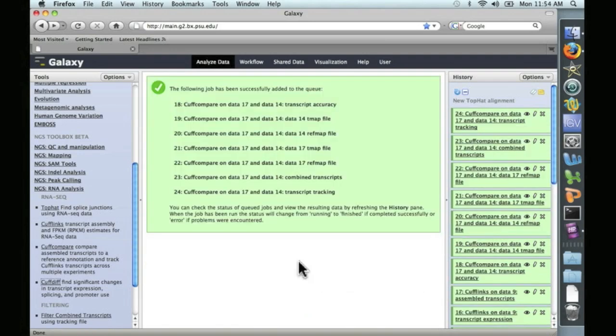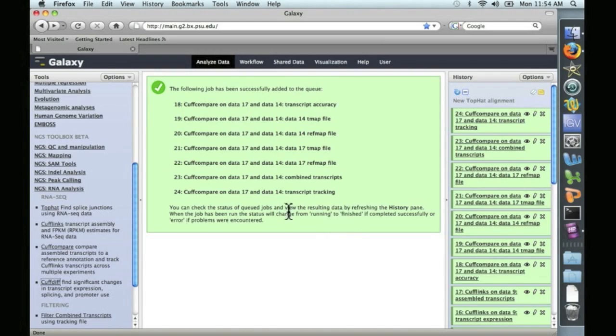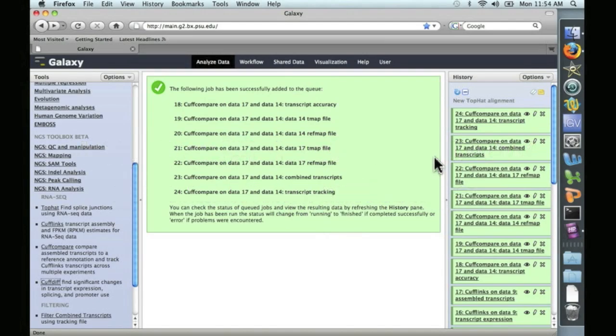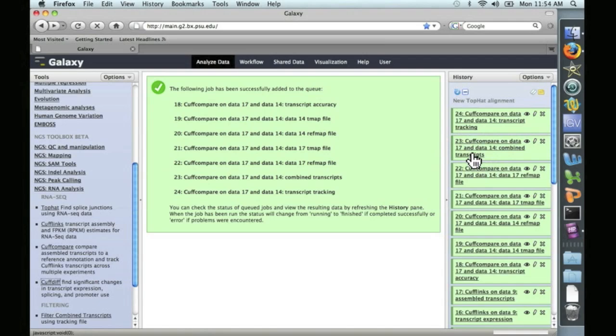That took less than 10 minutes. And this CuffCompare creates a whole lot of files, which, again, if you're interested in the details, you can check out the manual at the following URL. We're only interested for now in this combined transcript file, which is what CuffDiff is going to use.